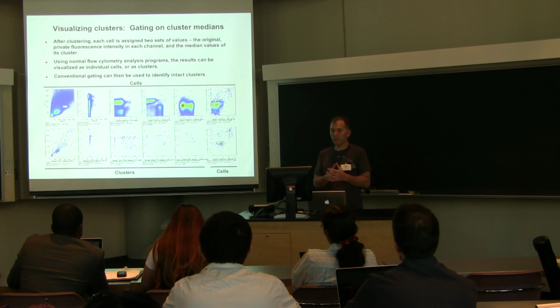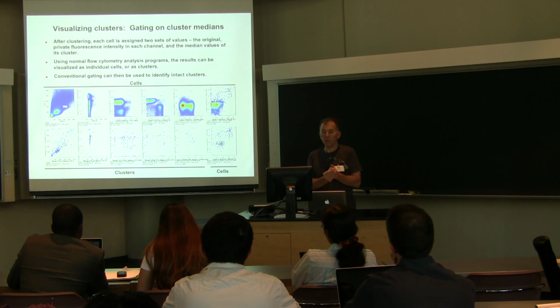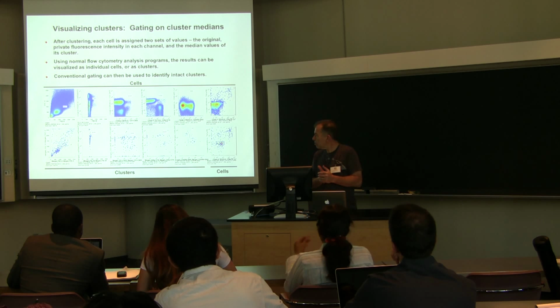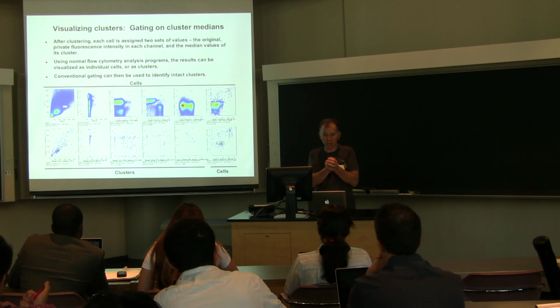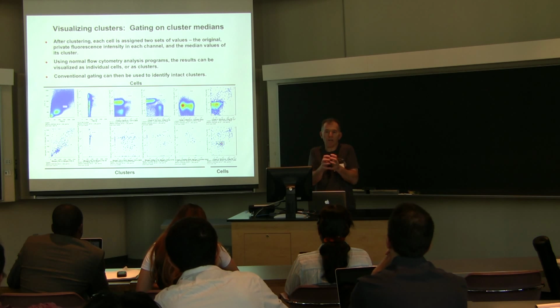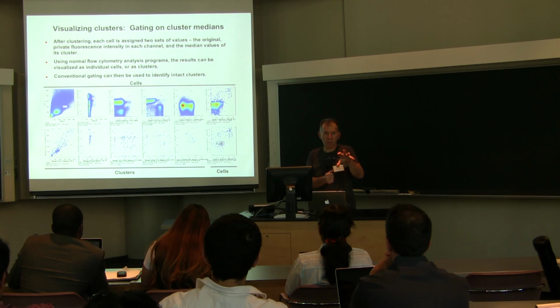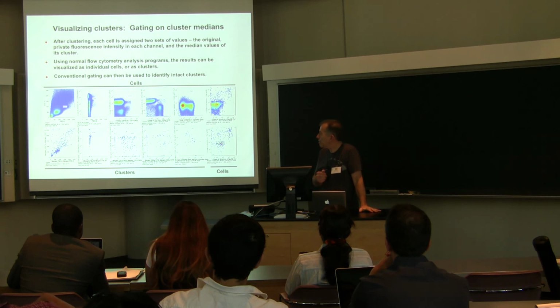Because we tend to separate into a lot of different clusters, we need a post-processing method that's capable of exploring that kind of diversity. And when the clusters are focused into their medians, it basically pulls in a lot of outliers to a single point, and that makes gating much easier. So you can catch a large population by catching a very, very small area in the middle of it. And in practice, that means that the gating is far cleaner, and you get through to the end result.